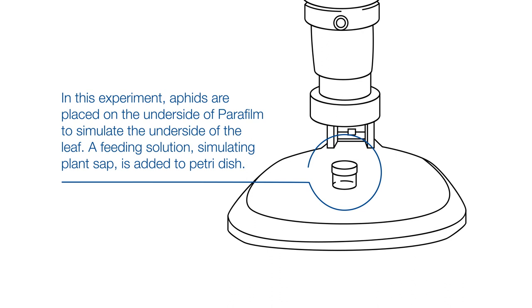In this experiment, aphids are placed on the underside of parafilm to simulate the underside of the leaf. A feeding solution, simulating plant sap, is added to the petri dish.